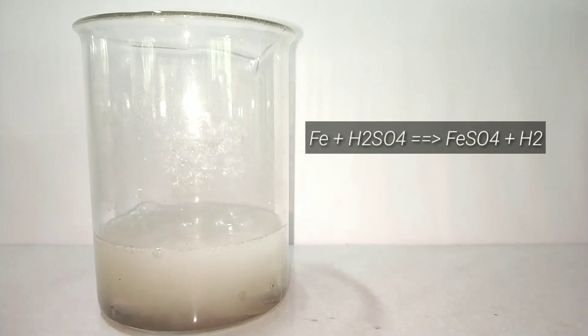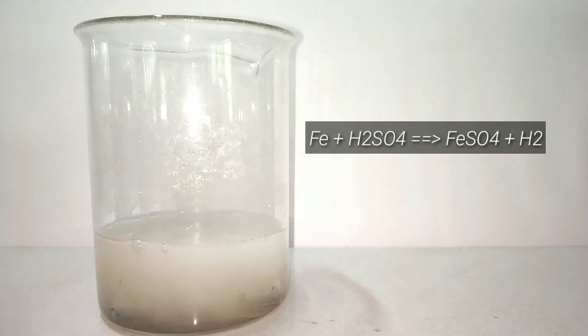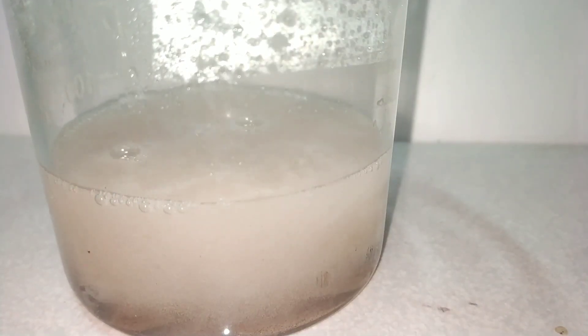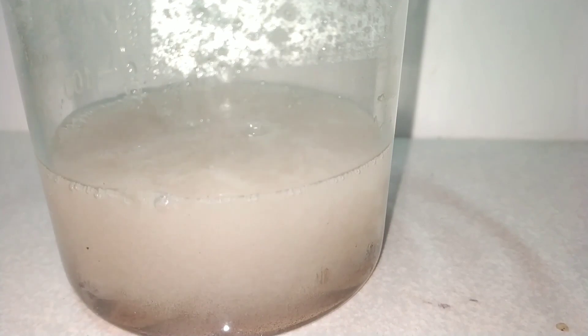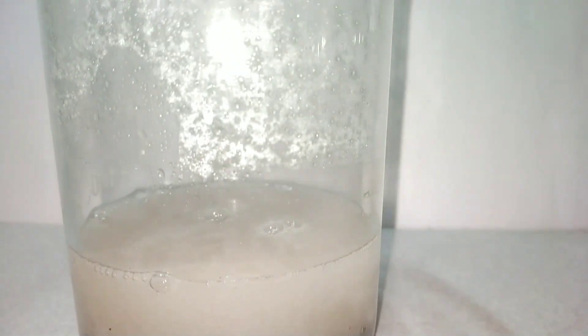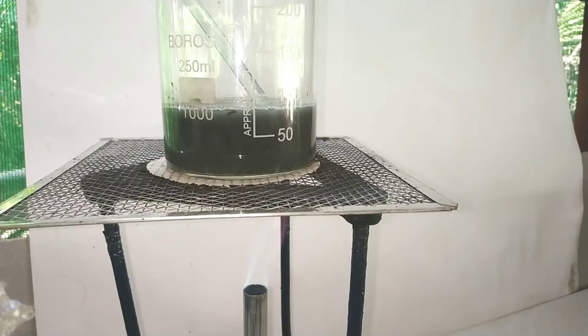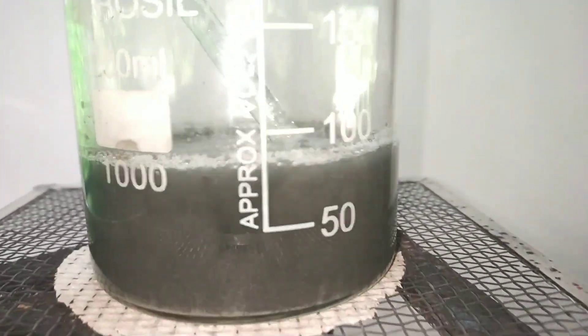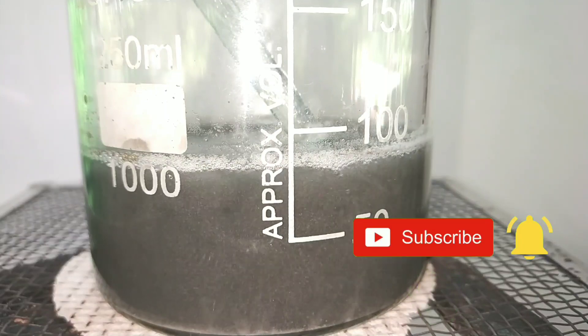After adding the acid we notice a lot of bubbling. Here iron is reacting with sulfuric acid to produce our desired product iron 2 sulfate and hydrogen gas. Hydrogen gas is being liberated as the bubbles. You can also see some brown color depositing that is the unreacted rust or the iron oxides.